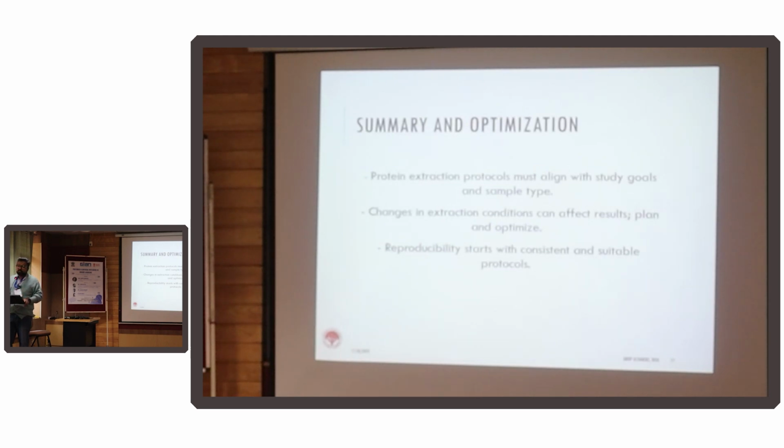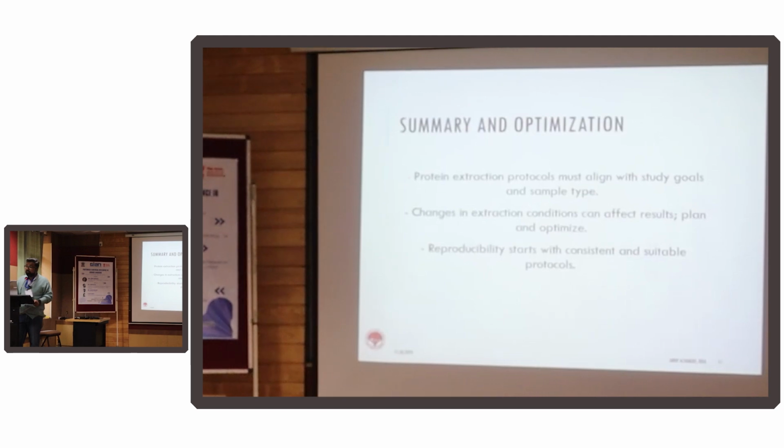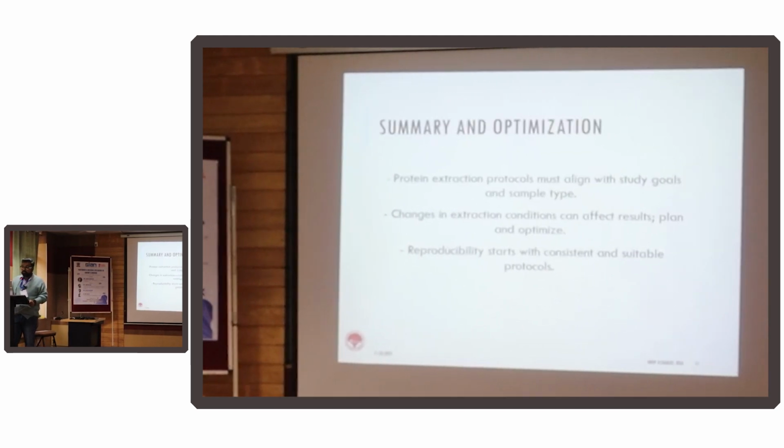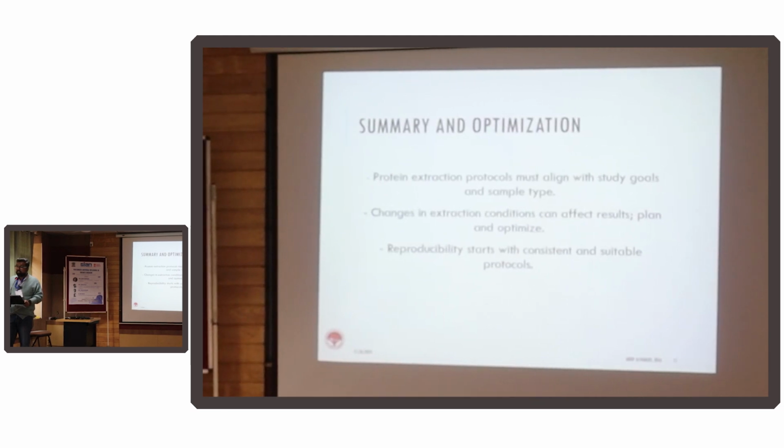Suddenly you find there's one very good way of getting proteins. Be very careful. You cannot use an apple protocol for one and an orange protocol for the other set of samples. If you have started with an apple, even if you get a better apple or a better orange, don't. So old is gold. Once whatever you have standardized, stick to it.